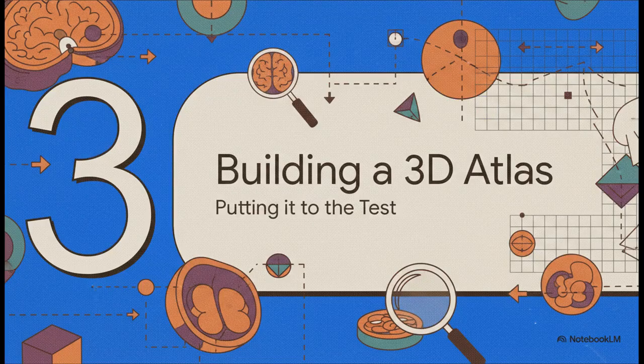Okay, that all sounds incredible on paper, right? But how do you really know if your computer-generated virtual slices are any good? You have to test it. So let's see how the researchers put this thing through its paces. And this is the mic drop moment. The researchers took a real 3D dataset, but they hid some of the slices in the middle. Then they asked SpatialZ to recreate one of the missing ones.